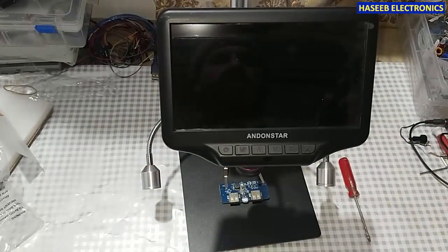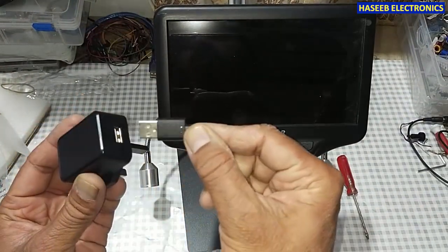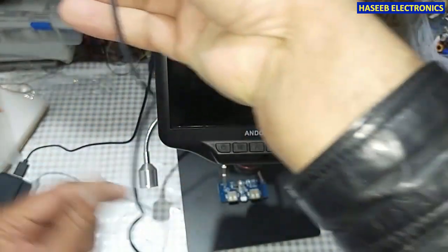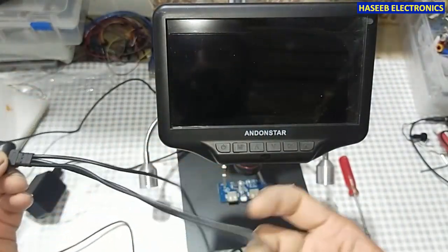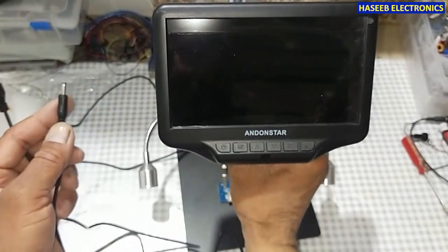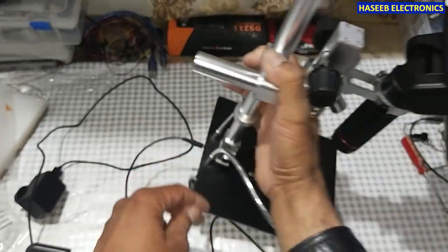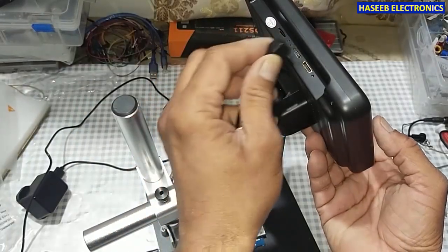Now I will connect the power cable to the power adapter. I will install this USB cable here — one side here. This cable reaches to the power control module, which has two outlets: the first pin is to apply power to the LED lights, so I installed it here, and the second cable is a USB power cable connected to the USB port.